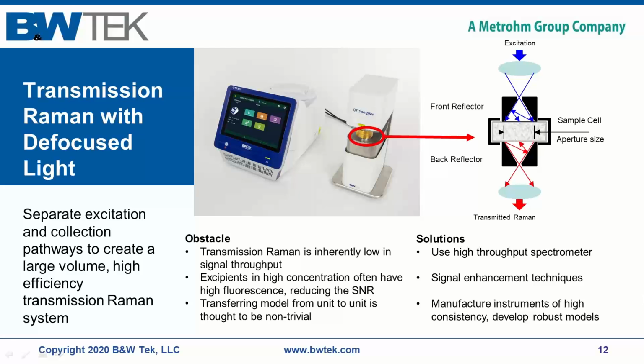Lovely, thank you, Catherine. This question has come in, hopefully I'll be able to word it right for you. So the main question is, why does the validation set need to be run on a second instrument during method transfer? And as a follow-up, can we not transfer the method from one instrument to another?